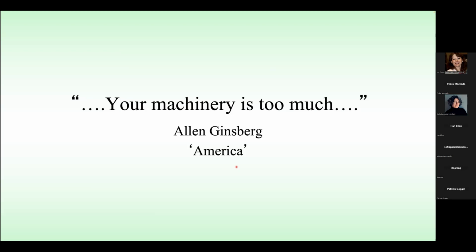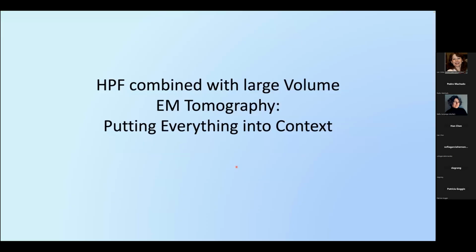I like that because if we study things out of context of the cell, of the tissue, of the organ, of the organism, we miss how these things function, and we miss how we can leverage our knowledge for disease treatment and other things like that. So I want to pull us back: how can we combine high pressure freezing, with its really high cellular fidelity, with large volume EM tomography?